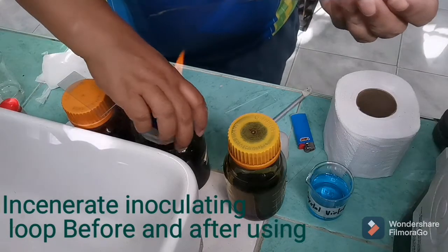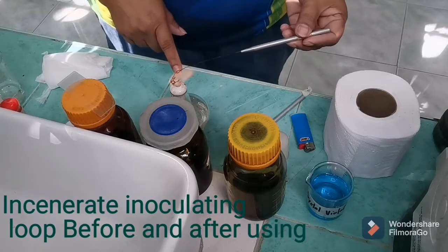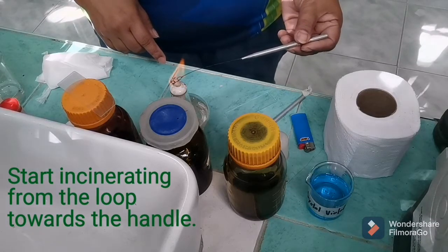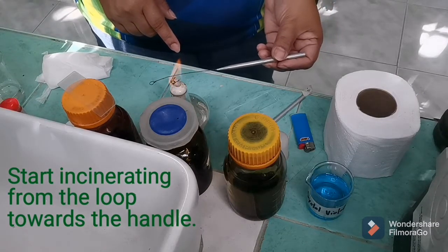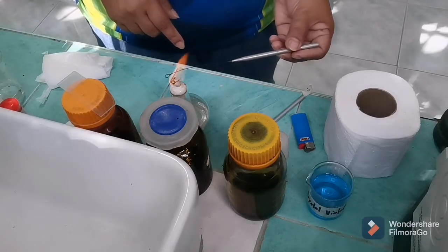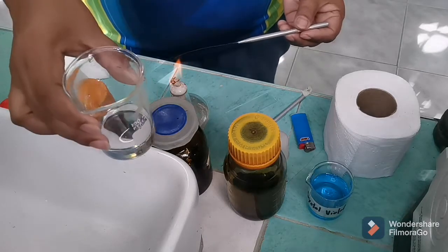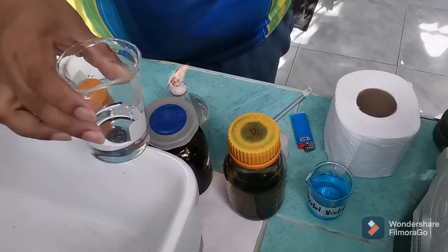In front of me is your alcohol lamp. I hope you can see the light. So I will pass the inoculating loop, starting from the loop, until it turns red. It will not take so much time. As you can see, there is already a red mark. So I could move this, incinerate this until the other part of the inoculating loop. Okay, I will cool it a little. And then I will fish out microorganism coming from the sample.